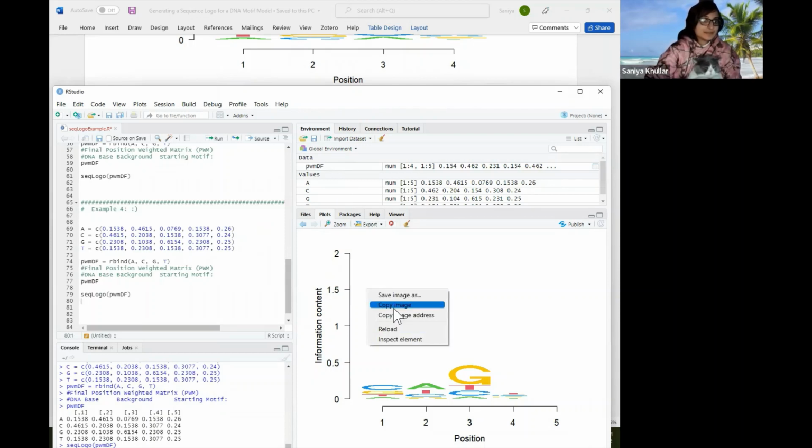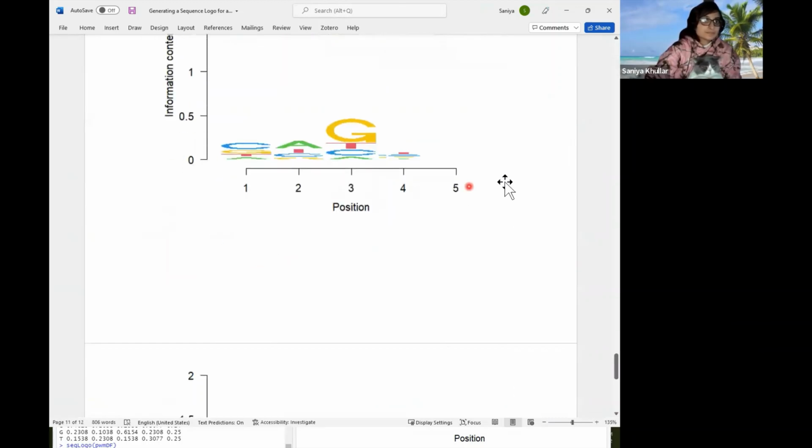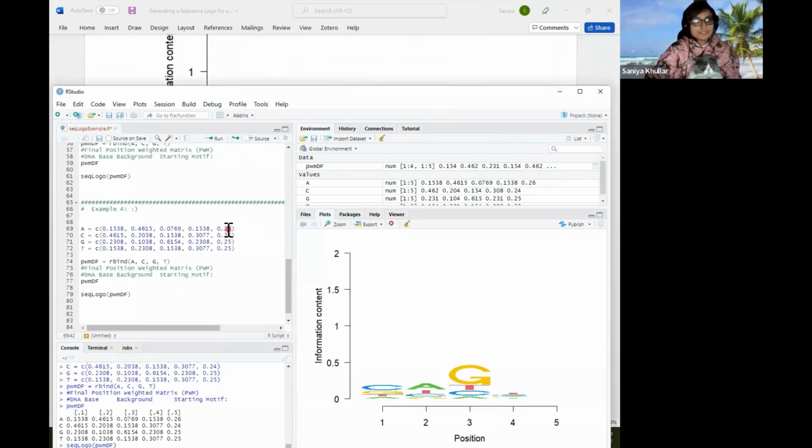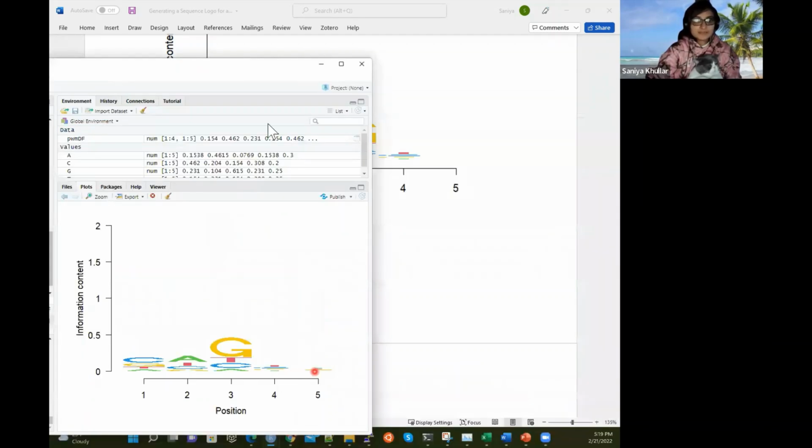Now let's see what we get. Still not marginally high enough to detect anything. So we can keep on playing with this. Maybe let me just make this like 30, and then let me make this like a 20. And now let's see what we get. Will we get anything at all? Yes, we get something really tiny.